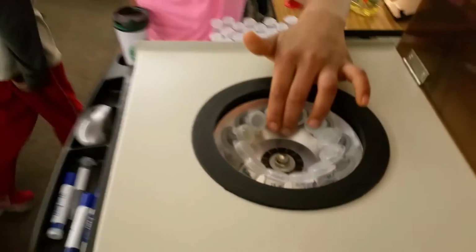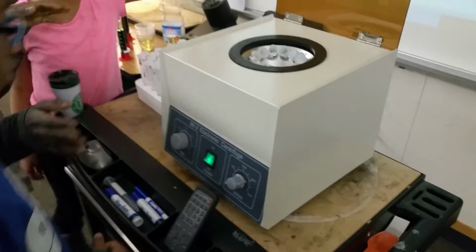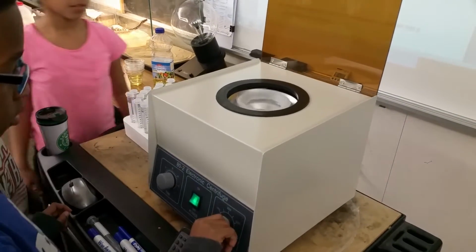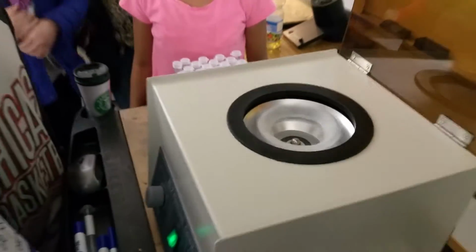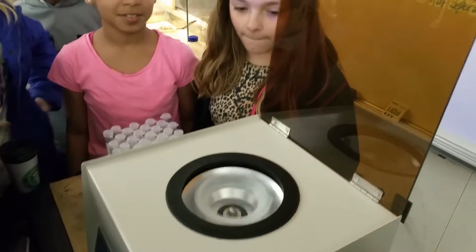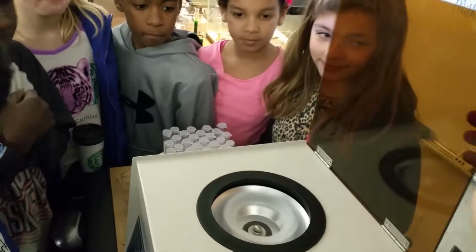That's great. Now, Jerome, let's check it. Are they in all the way? Yeah, looks good. Okay, and back up. Jerome, go ahead and flip the switch there. Over here. Turn that. There you go. And you can see it spinning there. And turn it up one more notch. There you go. Now make sure you don't stick your finger in there, because it won't come out the same. Okay. Now once it gets going like that, we'll close the lid here for safety.